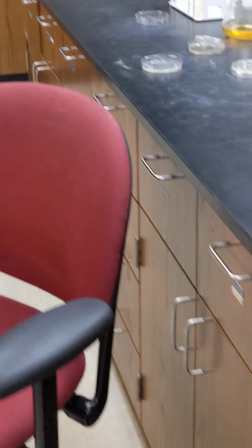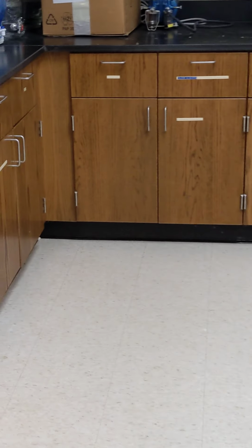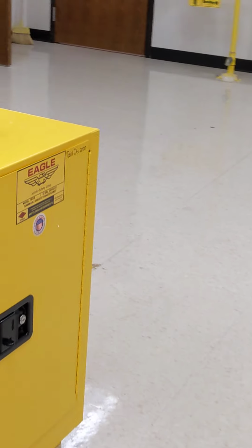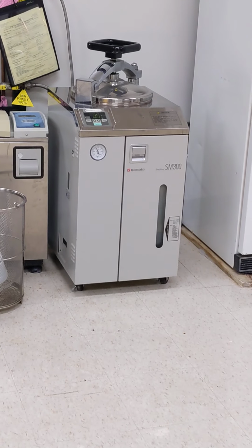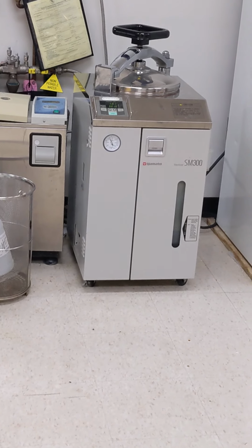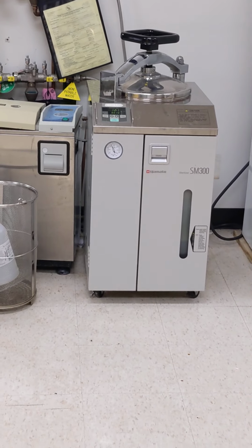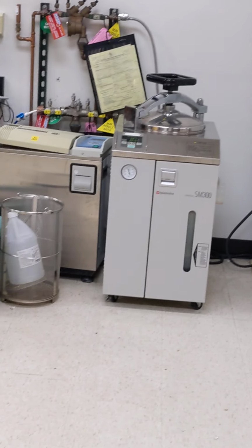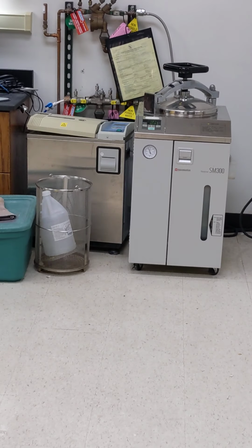So a few other things I want to tell you about making media as I walk you around the prep room here. Sorry about the dirty backs. I'm cleaning some stuff here. So when you make media, you have a wide range of temperatures and durations that you can choose from when you're using that autoclave. So when I'm doing it, I want to do at least 15 to 20 minutes to make sure that I'm actually sterilizing my materials. You can run the autoclave though for much longer. It really depends on your purpose.